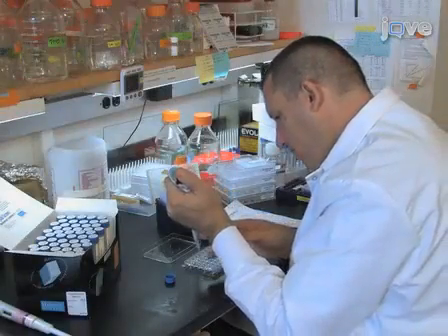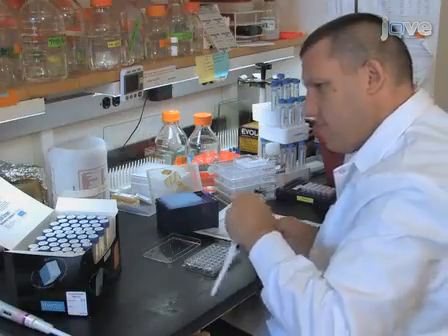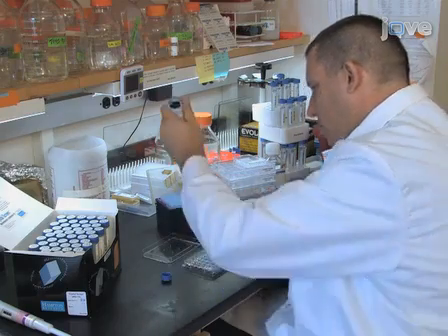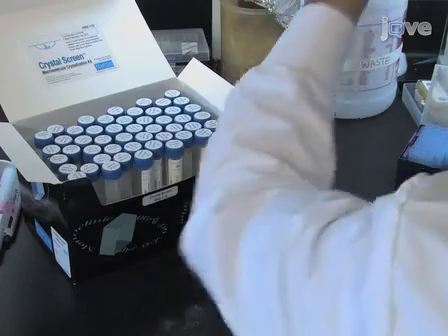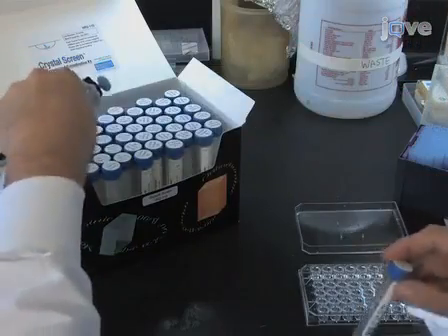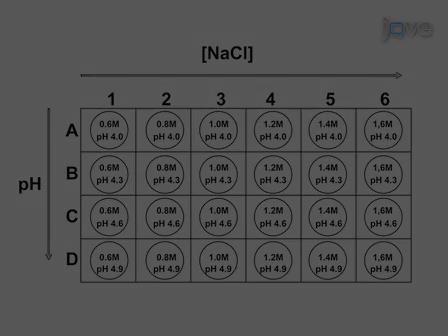To identify a crystallization method for a macromolecule of choice, initial screens can be performed using commercially available crystallization solutions that are chosen to exploit the sparse matrix incomplete factorial method of trial conditions. These conditions are selected based on known and commonly successful crystallization conditions for macromolecules. Once the crystallization condition is known, a narrow screen can be assembled varying the precipitant concentration and pH around it.